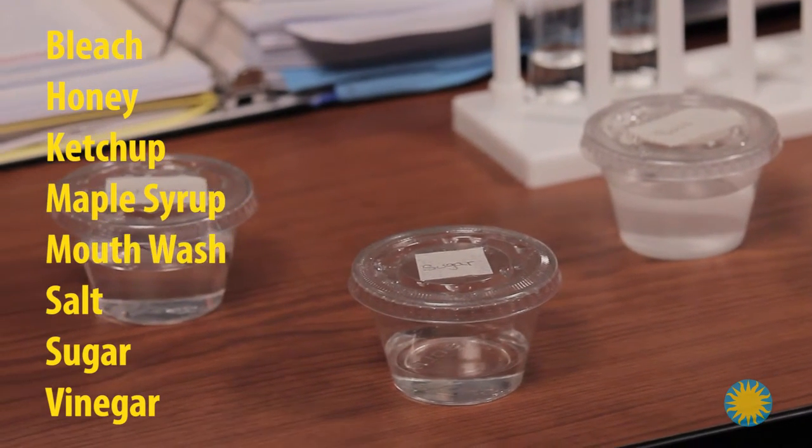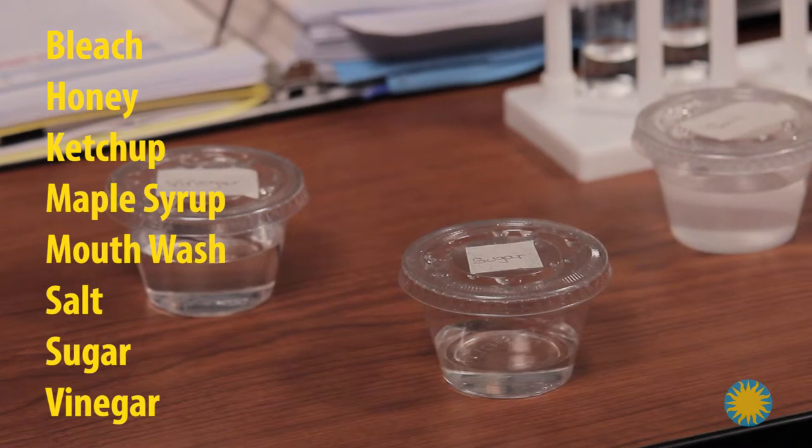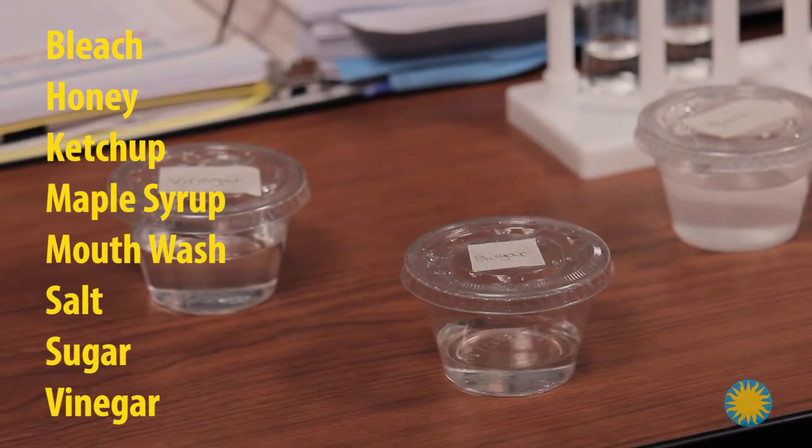Instructions on how to make the 10% solution for each substance are clear. Just make sure to give yourself time to prepare and label the 4 ounce plastic cups.